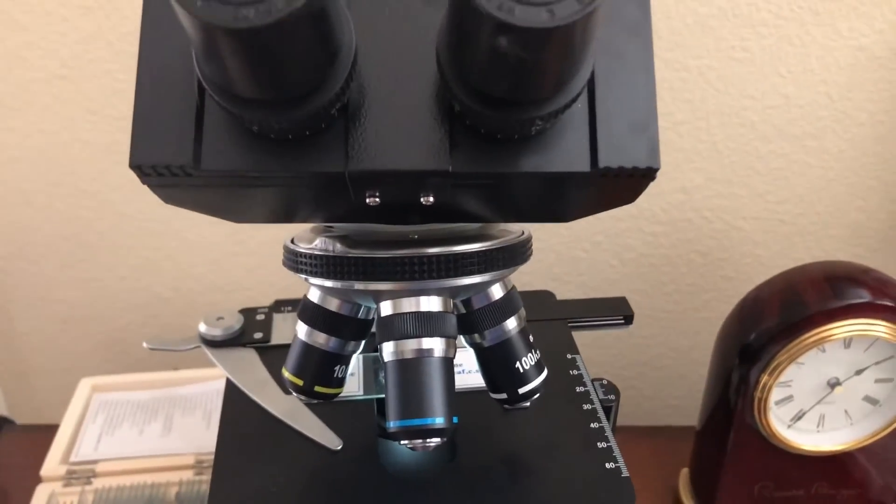So, in time, they have all clumped together. The unfortunate part is I can't tell you what they are, but I still wanted to show you — because it looks like red blood cells, and it would make sense that we had some rain and then those formed. I'm sorry, I cannot get a better image than that. I'll have to find a better way, but I'm learning.